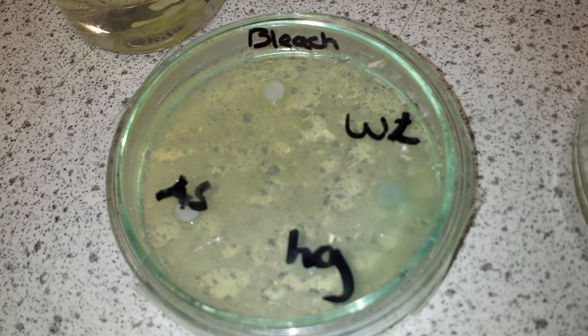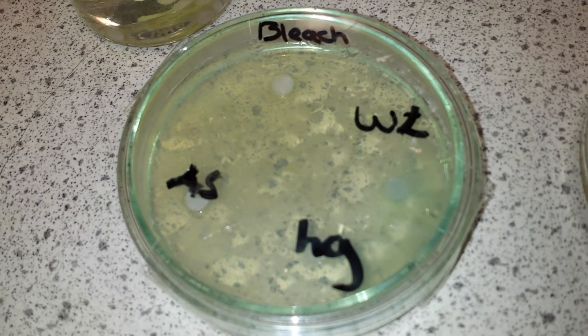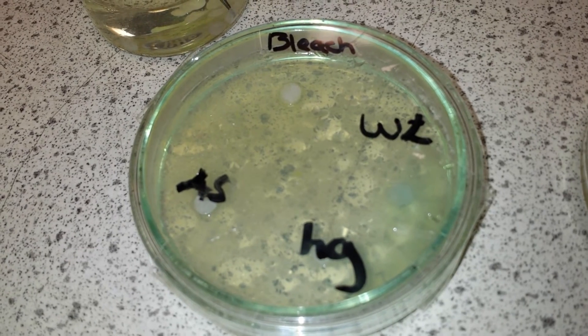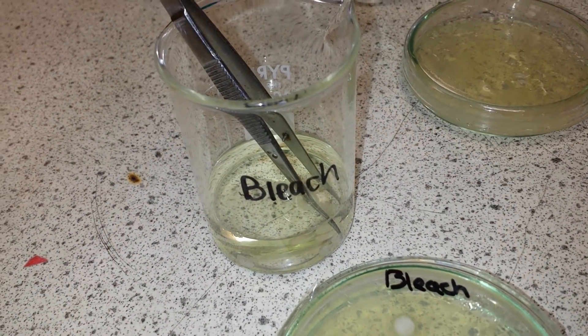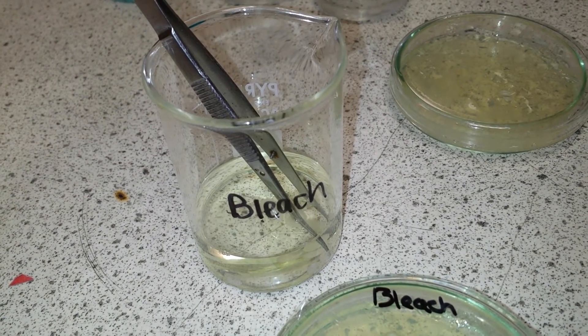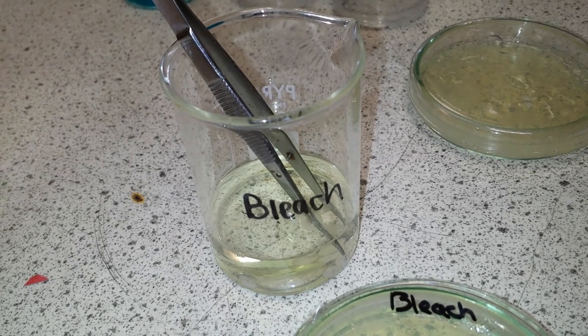What we're hoping to see is that when the bacteria grows, it won't grow everywhere on the dish. This will show us that products such as bleach actually will kill something like Micrococcus luteus, and so we know that we can use them as an antibacterial agent.